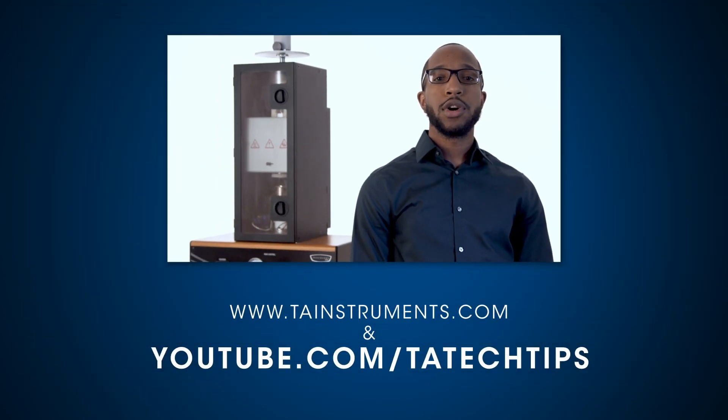In this Tech Tip, we put together the cell for non-solid samples in the DTC-300. Please stay tuned for more helpful tips from TA Instruments, and thank you for your interest.